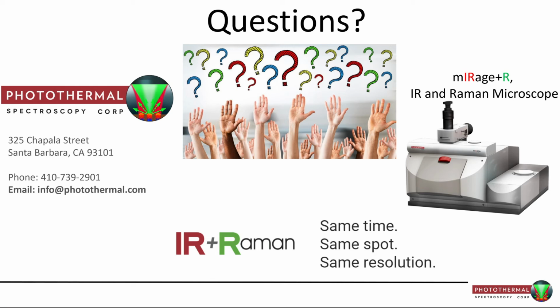Thank you for that. Actually, I've got a follow-up question, or maybe even a comment. I assume you were using the special low-power detector, the APD. Is that what you used? Sorry, I don't know which detector. Yeah, because your comment triggered me: you said this is a pigment, and they're usually very sensitive to bright light.